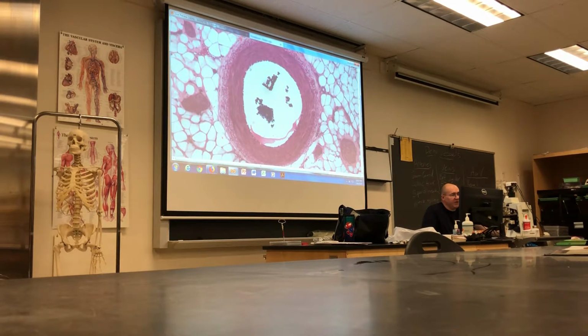So the very inner layer, this really thin layer hanging out within here, looks a little rippled on a lot of your arteries. What's that? What tunic is that going to be? Your tunica interna, right? Or tunica intima hanging out within there. And it's really thin, right? Because then we go off and see this big, thick, smooth muscle layer. You might see a little bit of elastic fibers and stuff in there too, depending what artery you're looking at on your particular slide.